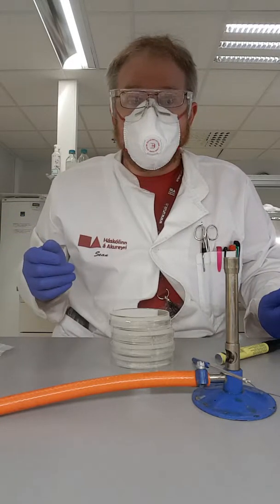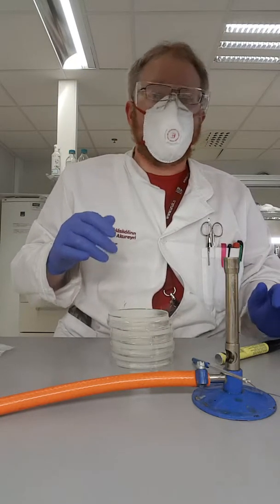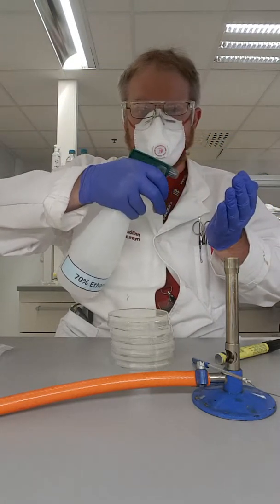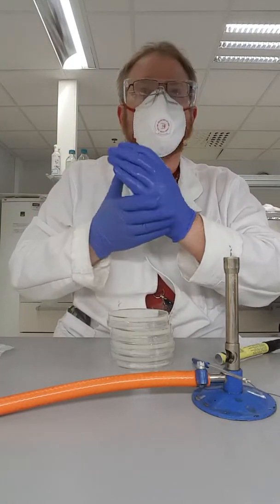So I thought what we could do is we could put it on some of these petri dishes and see exactly what's in there. What I've done is I've made my hands clean with some alcohol, which is very good for killing bacteria and fungus and all sorts of stuff.